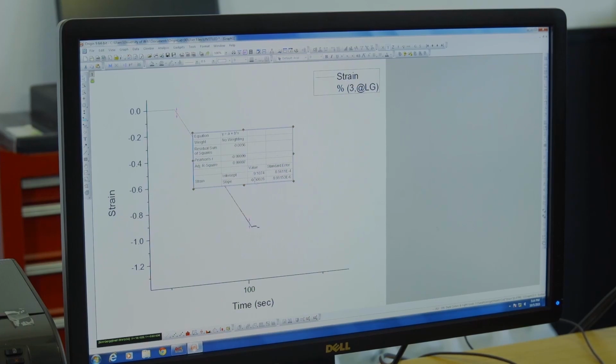So here, you would find out in some cases that you don't achieve this strain rate. That means you have to repeat the experiment and you have to make some adjustments when computing your parameters on the QuickSim software. So this is the quick check that you would always do to ensure that the Gleeble had done what you want it to do.